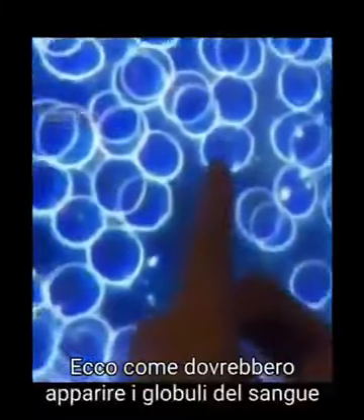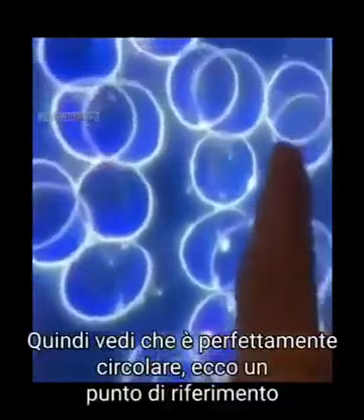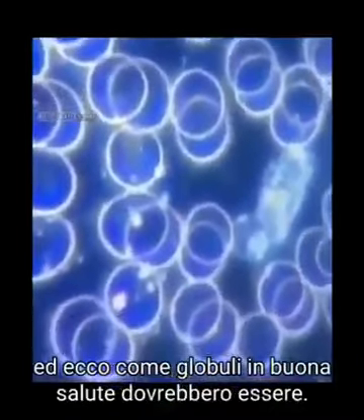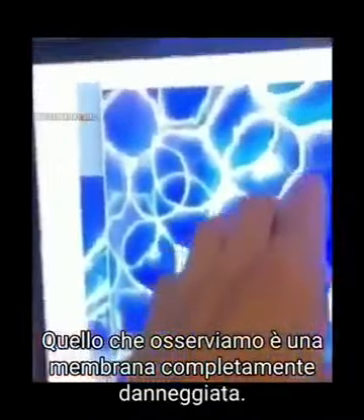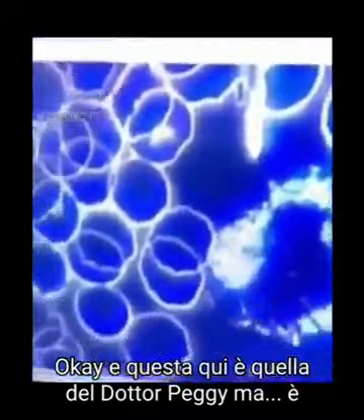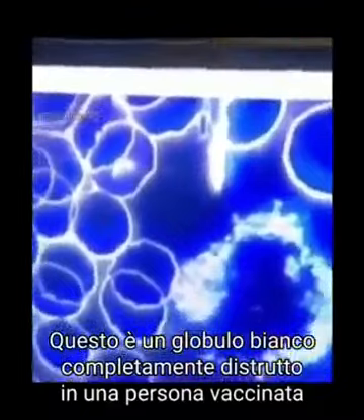Let's look at this live. This is what blood cells are supposed to look like. A white blood cell, you see the activity, right? And the membrane is the way it's supposed to be, right? If you could see, it's perfectly circular. This is the visual reference on how good blood cells should be. Here we're seeing a totally corrupted cellular membrane. And this here is what, Dr. Peggy? A white blood cell, but it's destroyed. This is a white blood cell that has been totally destroyed in a vaxxed person. Yeah. Right.